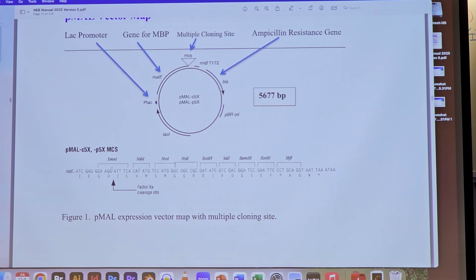But we're putting in a whole coding sequence right here, and so we're going to make protein, and our protein sequence, our cDNA, ends with the stop codon. So ours will end with the stop codon from our gene, not that stop codon. That stop codon will be there, but that's not the one we'll use. Does that make sense? If there's anything confusing, when we actually get your sequences, we're going to look at exactly how this goes again. And sometimes it's easier to visualize everything if you have your own sequence in front of you. So we'll be doing that soon.